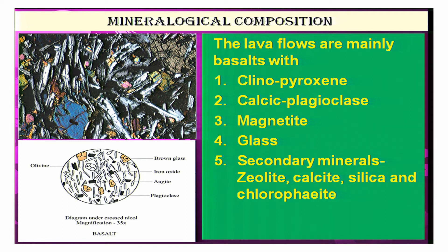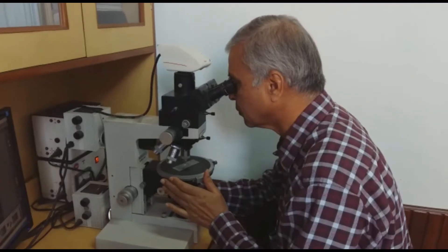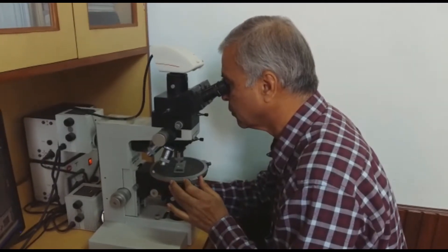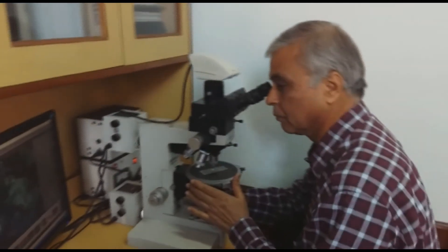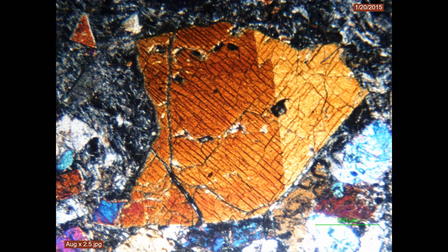When you see under polarized light, they display different colors. Under cross-nicols, the colors may change. When you rotate the stage of the microscope, these minerals display a variety of colors — from light shades of gray to dark shades of yellow, brown, gray, green, or purple. See how multicolored these rocks are.